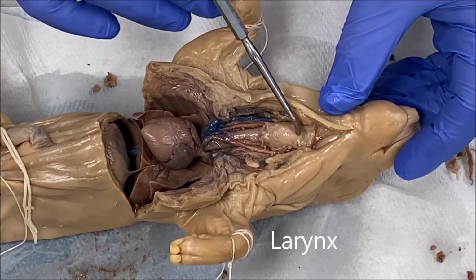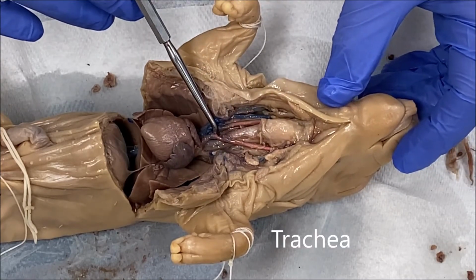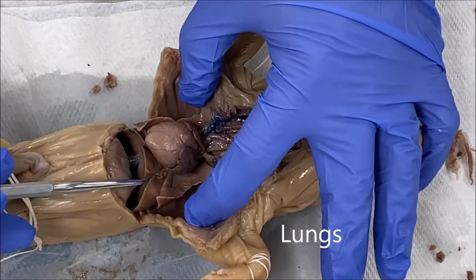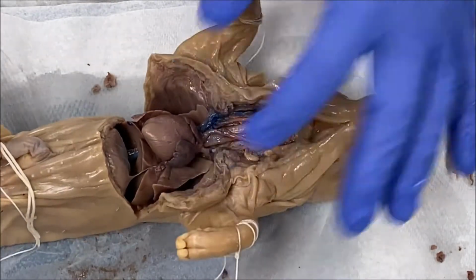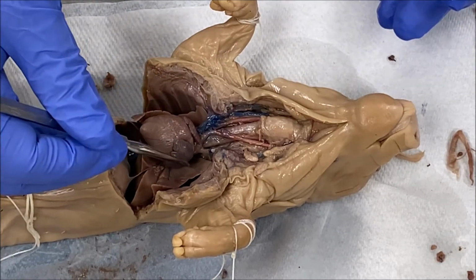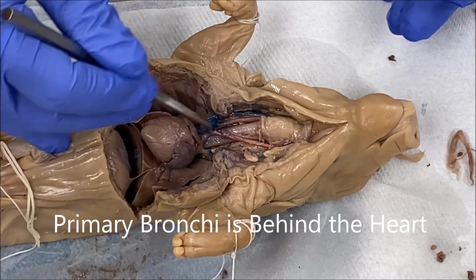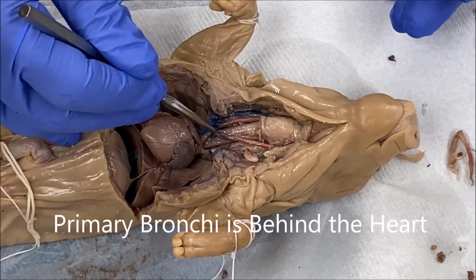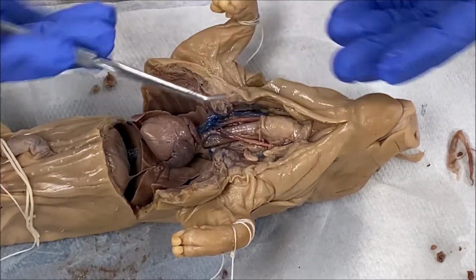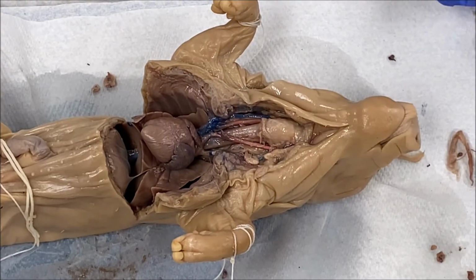This is the larynx. Below the larynx is the trachea, and then you have the lungs. Those are the only structures that you can clearly see from this view. You can't see the primary bronchi that go into the lungs after the trachea, because the heart is in the way. So really, it's the larynx, the trachea, and the lungs that you'll have to be responsible for identifying.